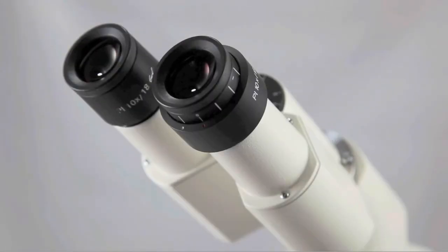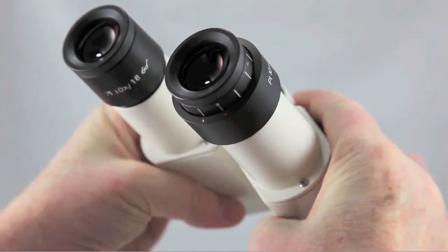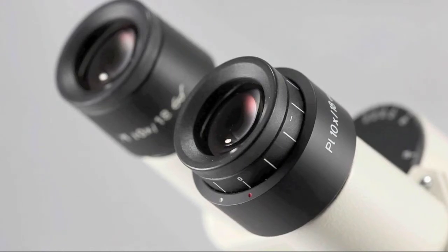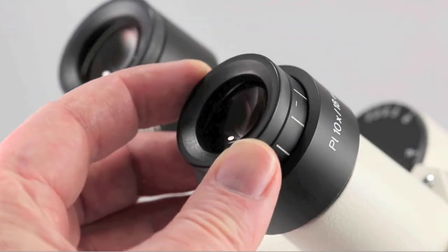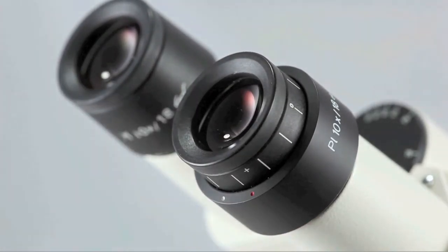If you haven't already done so, adjust the width of the oculars to fit your eyes. Establish your focus with the left eye, then adjust focus for your right eye using the diopter ring on the right ocular.